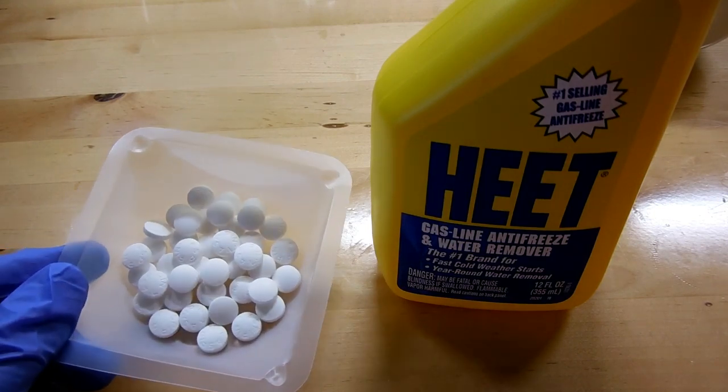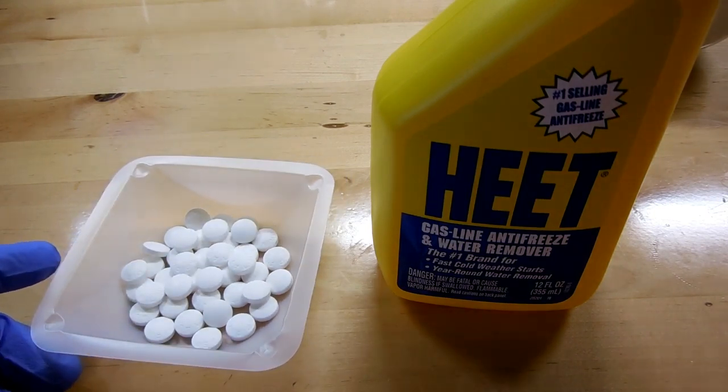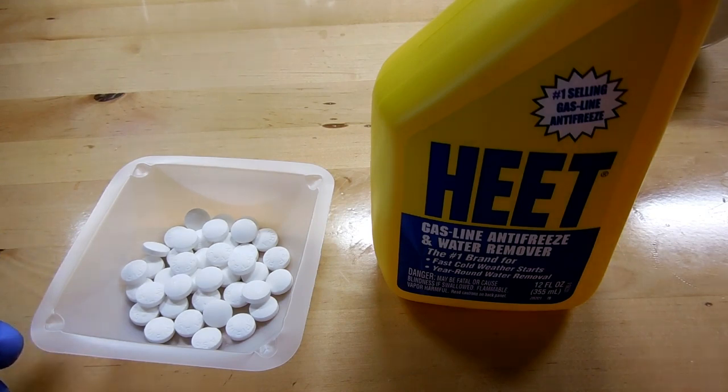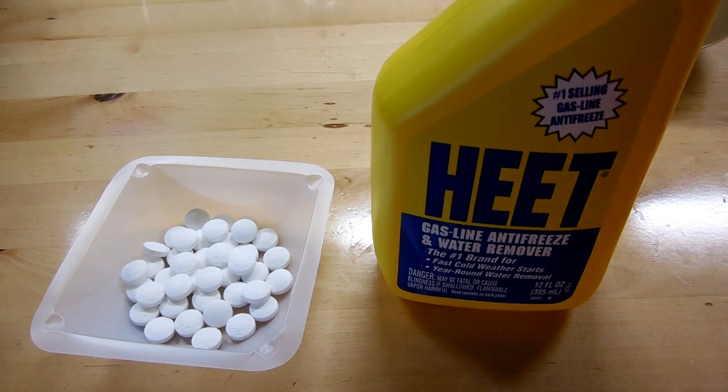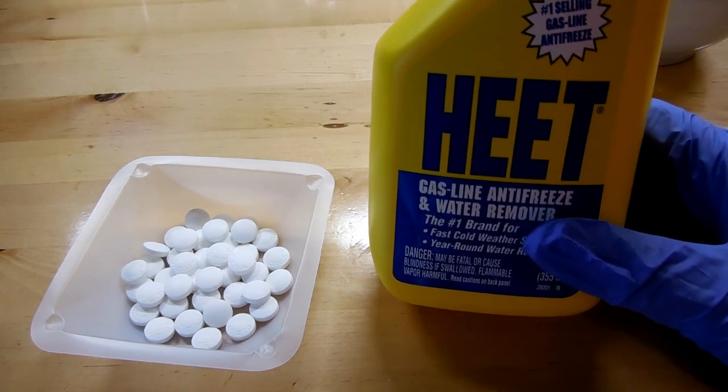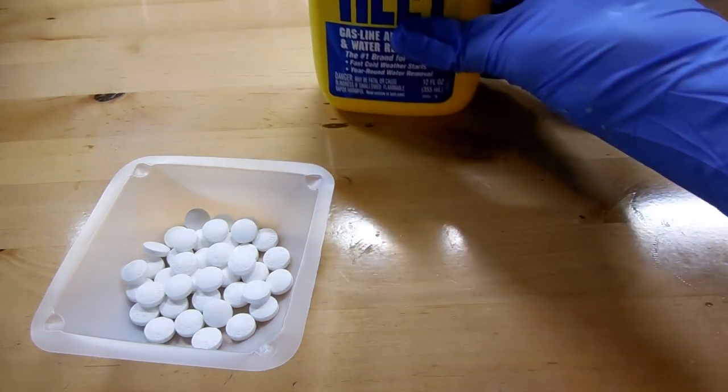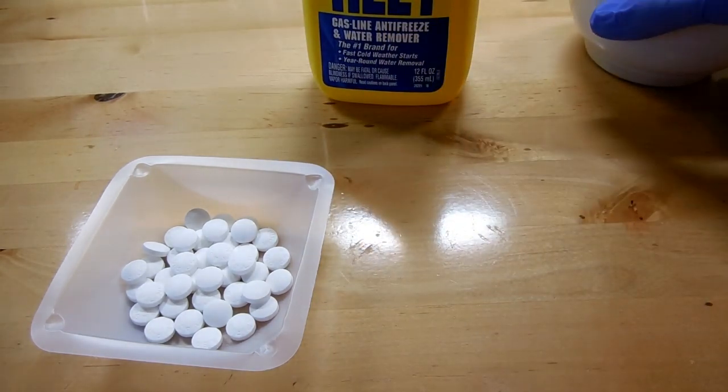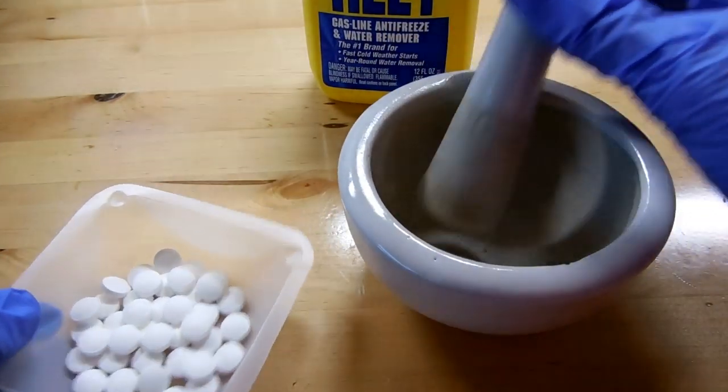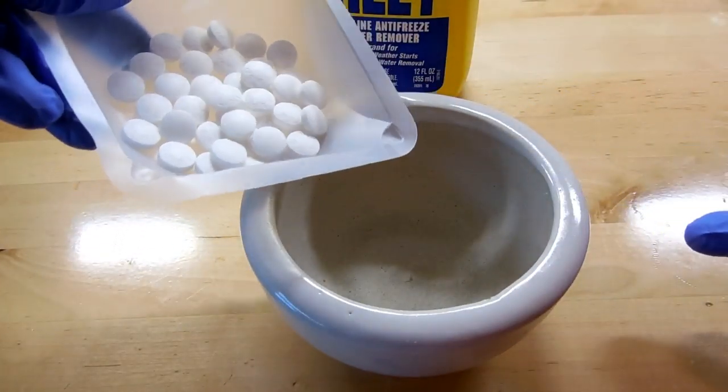These are 40 tablets of aspirin which each contain 325 milligrams of acetylsalicylic acid, the active ingredient in aspirin. That's going to give us 13.0 grams of the acid and we're going to react that with methanol. My methanol source is heat antifreeze. First of all we need to grind these tablets down into a powder so the reaction can proceed at a reasonable rate.